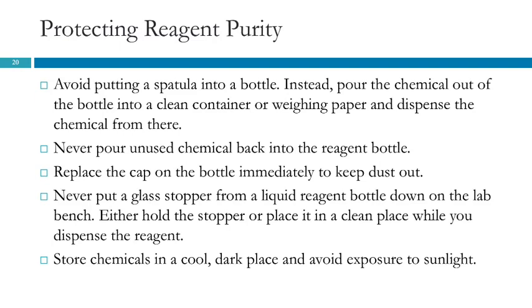Now, is this always critical? No, it isn't. Like, what was it the other day you guys were having trouble with? You were using the mallet? It was the phenol. Phenol. So the phenol was caked up, and there's no way you could pour that nice crystalline out of there. That's not going to happen. It was jammed in there.